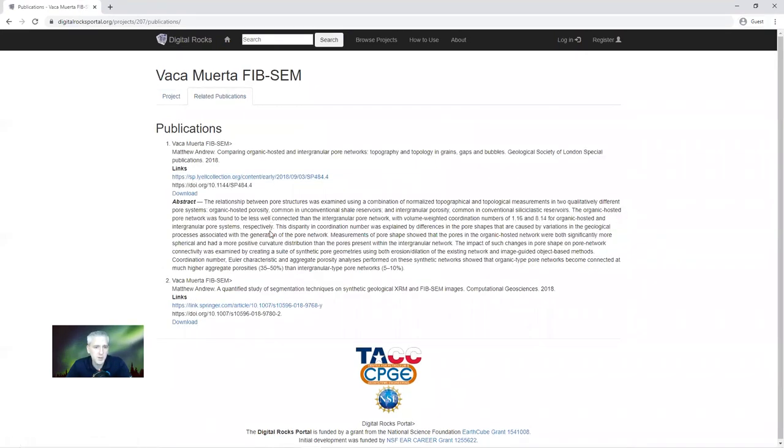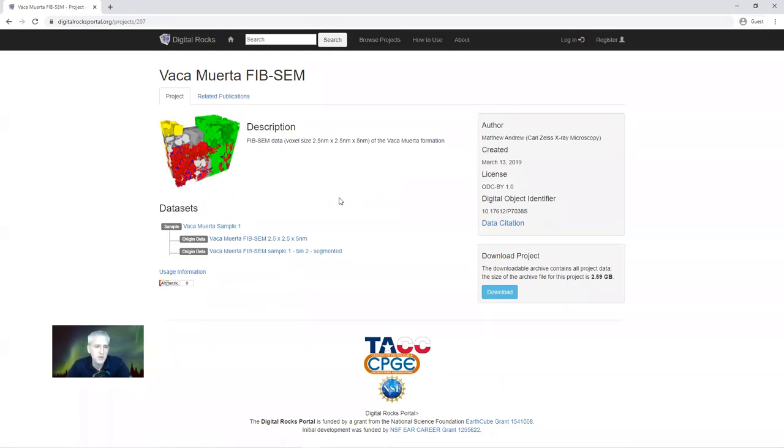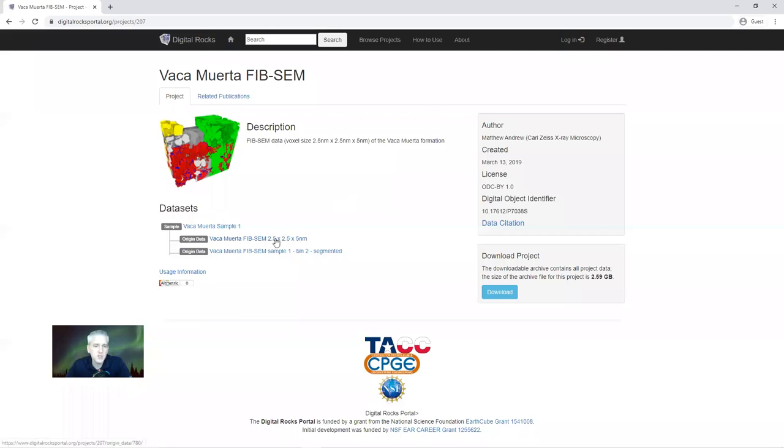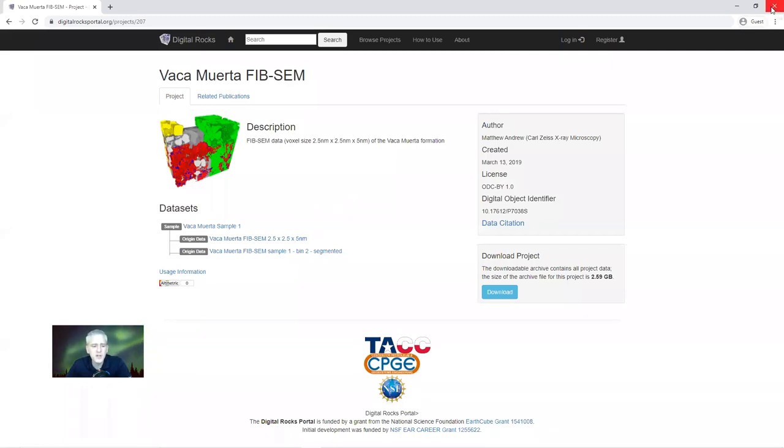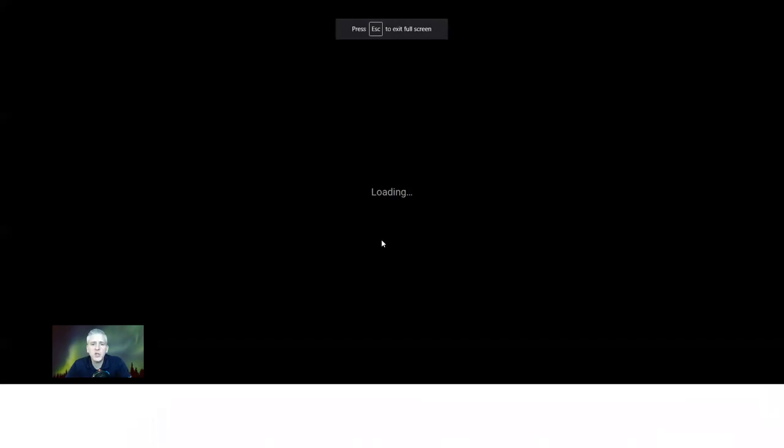If you go to the Digital Rocks Portal website, Google it, and you search for FIB, you will find the Vaca Muerta shale. This data set that you can download here has already been aligned, and it's also already been segmented. The data set that I'm going to use today is the exact same data set, but it has not been aligned. These are a serial FIB-SEM imaging stack at 2.5 by 2.5 nanometers per pixel and 5 nanometers for the slice thickness. So that's the data set we're going to look at today.